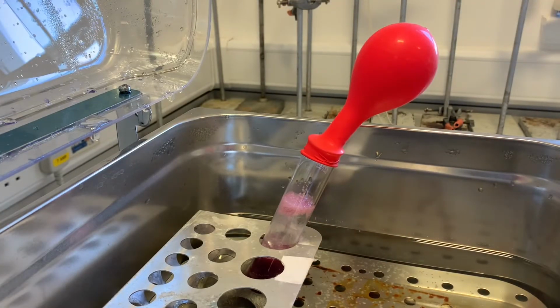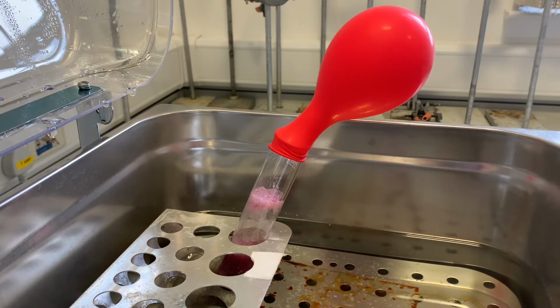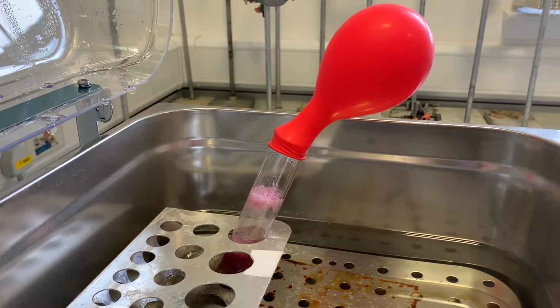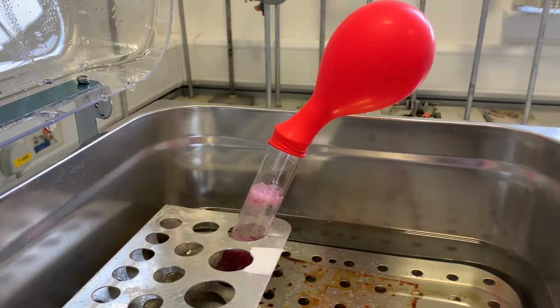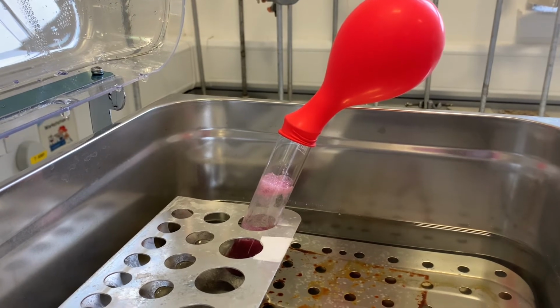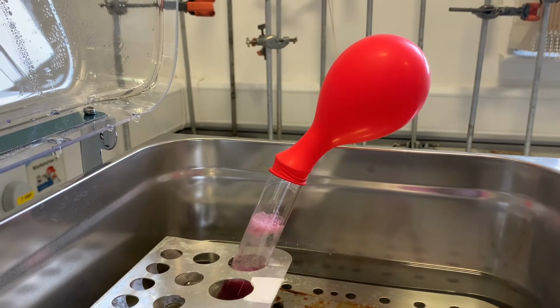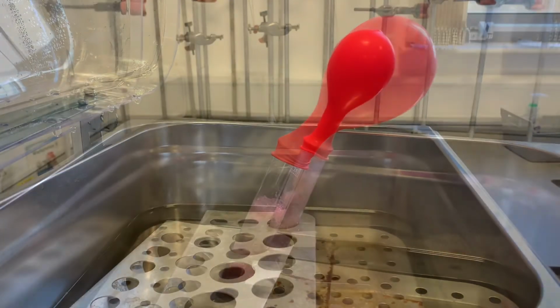So as you can see now, the yeast has respired anaerobically, or without oxygen, which is known as fermentation. It's produced carbon dioxide gas, and our balloon is now full of carbon dioxide gas. A little bit more time on and even more carbon dioxide gas has been produced, and it can't go anywhere, so it's just further inflating the balloon. So the balloon serves two purposes: one, to create conditions where no oxygen is present, and two, to collect that carbon dioxide gas so that we can actually see how much has been produced.